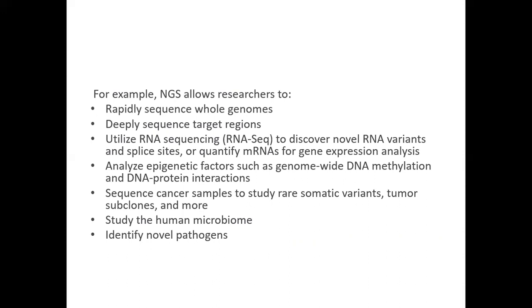Or we can deeply sequence target regions. In case we have some target regions, with NGS we can sequence them. Or we utilize RNA sequencing to discover novel RNA variants and quantify messenger RNA for gene expression analysis, right?